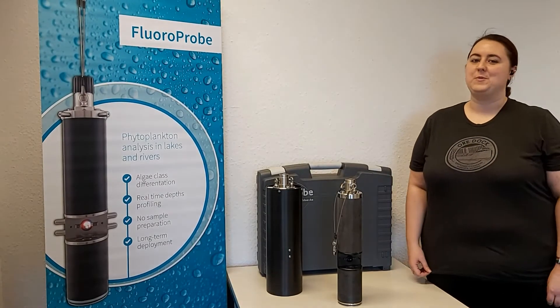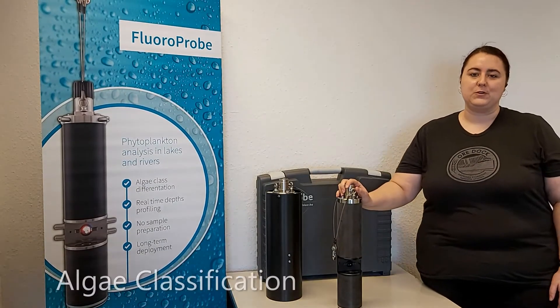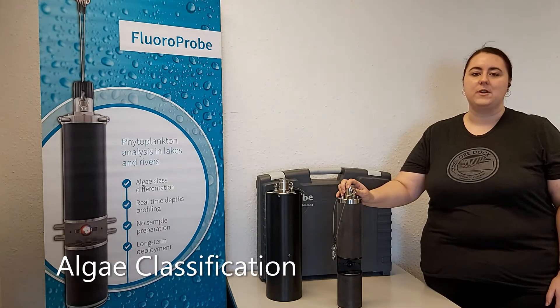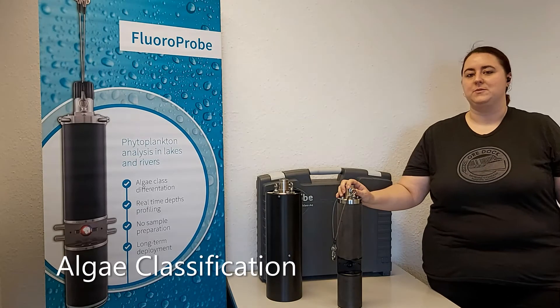Hi, today we'd like to tell you a little bit about one of our most popular instruments, the BBE FluoroProbe. The FluoroProbe is a submersible fluorometer for the detection of algae in water, which is also capable of measuring concentrations of different algal classes, such as green algae, blue-green algae, diatoms, and cryptophytes.